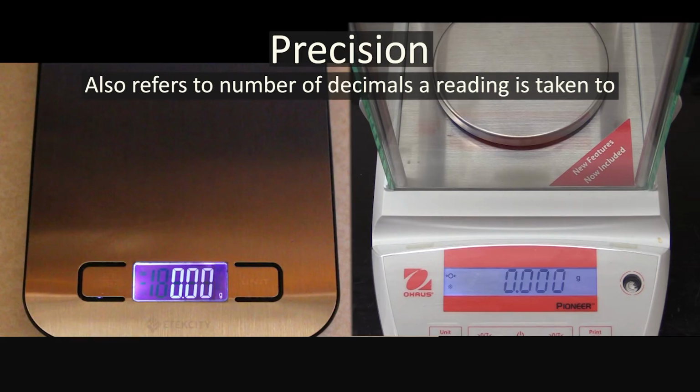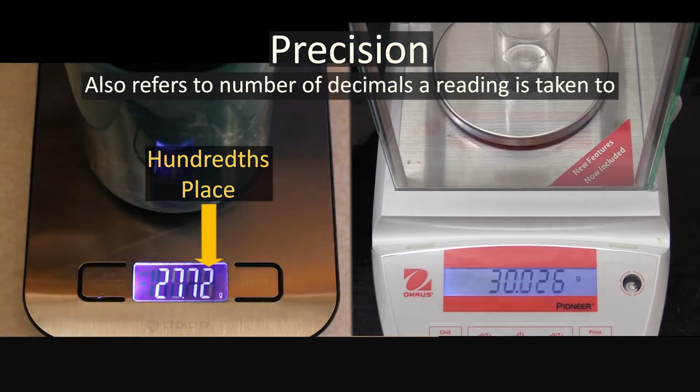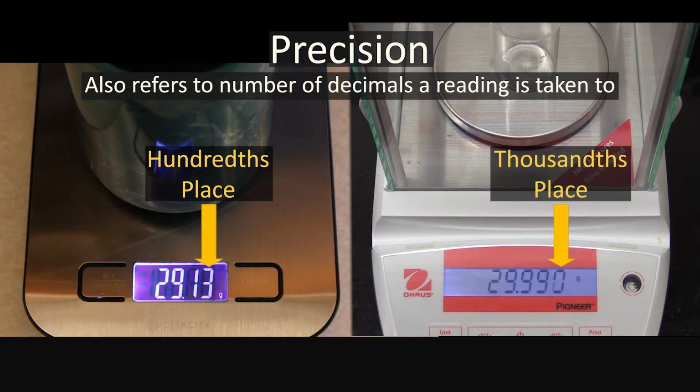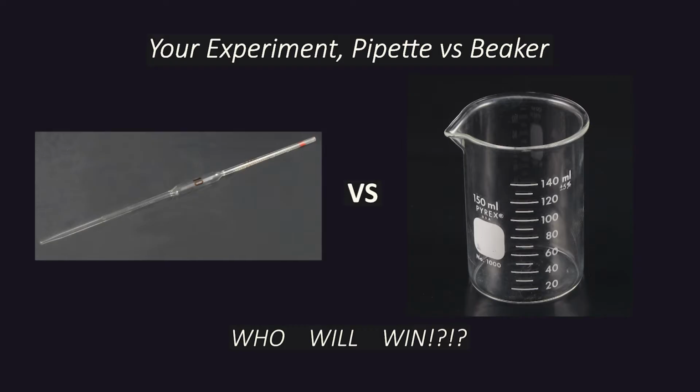The other way to look at precision is as the number of significant figures your measuring tool gives you. To show you what I mean, let's look at these two scales. The scale on the left gives us readings to the nearest hundredths of a gram, while the scale on the right gives us readings to the nearest thousandths of a gram. Since we get an extra digit from the latter, we'd say its readings have more precision. In this experiment, you are going to compare the accuracy and precision of a beaker to that of a pipette.